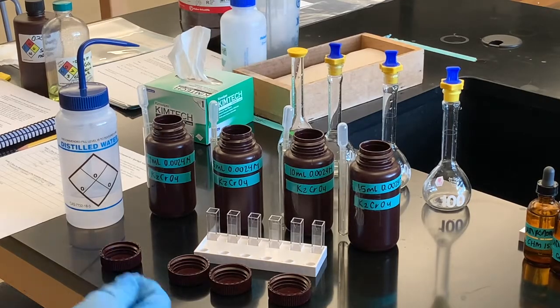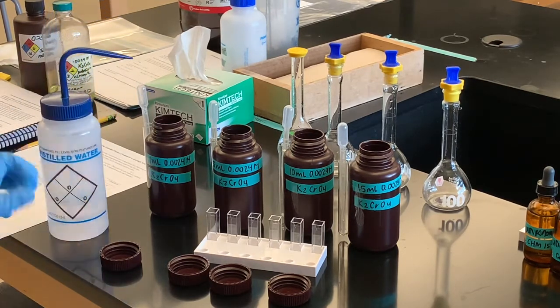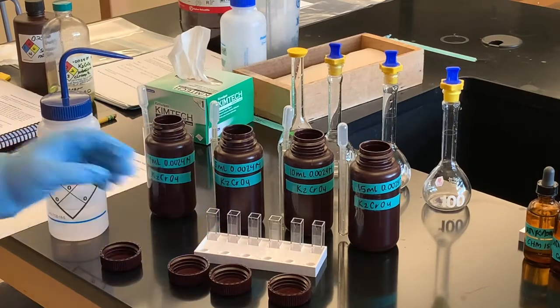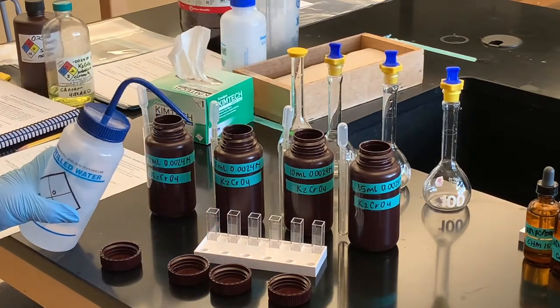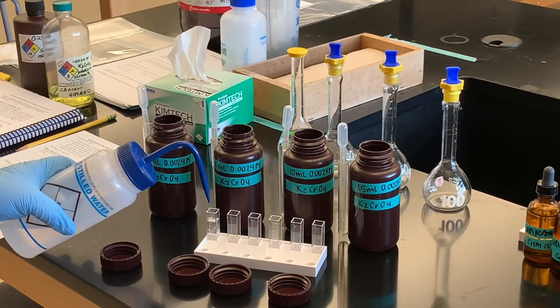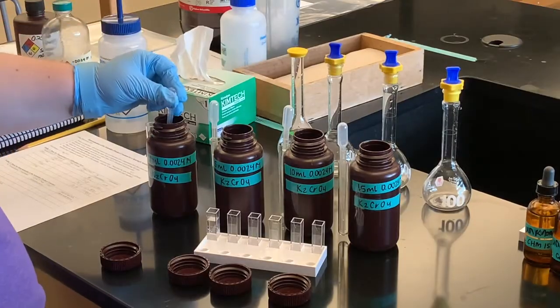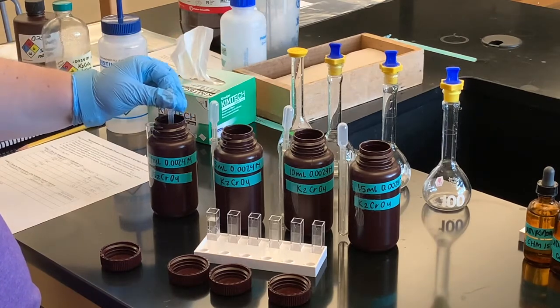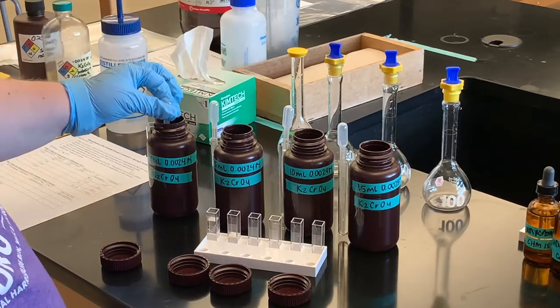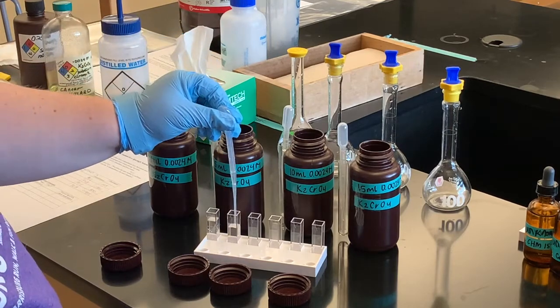I'm ready to put all of my solutions into the cuvette for the Spectronic 200. We're going to use the Spec 20 feature. The cuvette is this little square-looking test tube type thing that fits down into our machine. We need one with just plain distilled water, and I'll fill each up to the line. I moved the solutions to little brown bottles so I can use this pipette to transfer more easily to the cuvette — doing it in order: one milliliter to 15 milliliters.